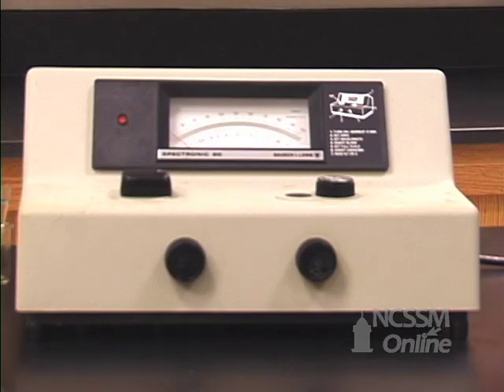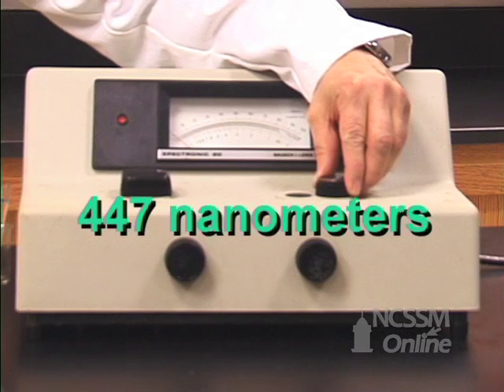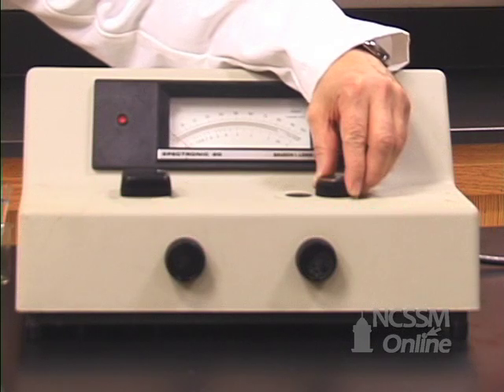We set the wavelength on the spectronic 20 to 447 nanometers. At this wavelength, the complex ion absorbs strongly, but the thiocyanate ion and the iron plus 3 ion do not.